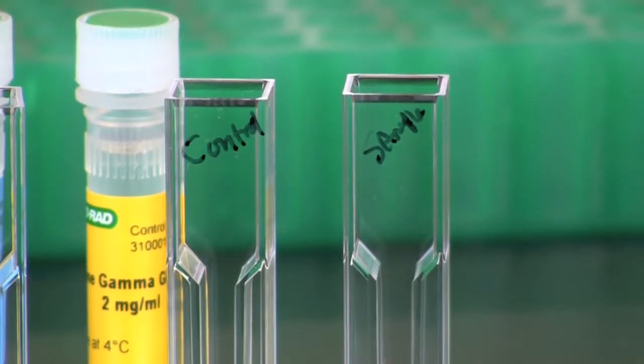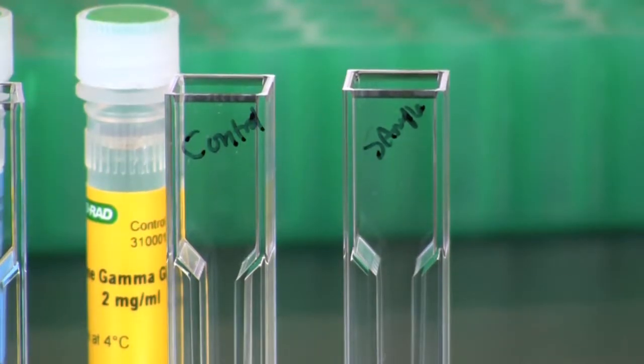Label 2 cuvettes, one control and the other sample. Do not handle the cuvette where the light passes through and make certain your labels are well above this area.